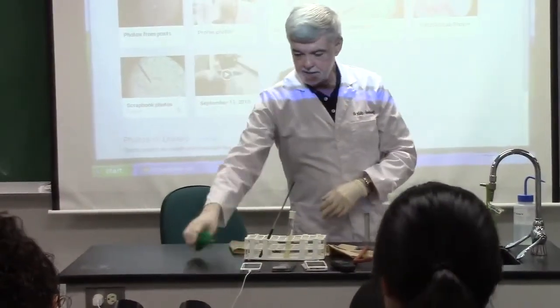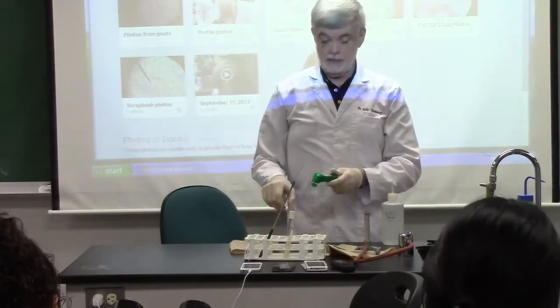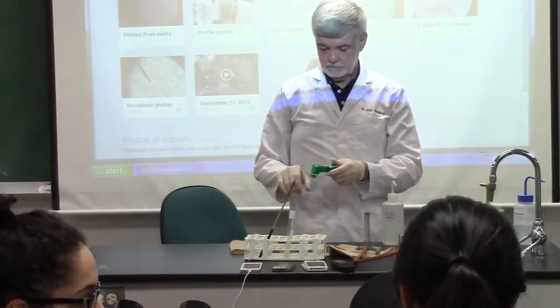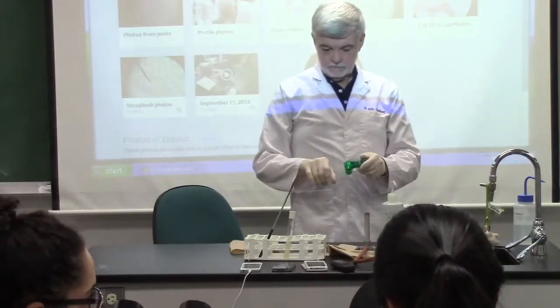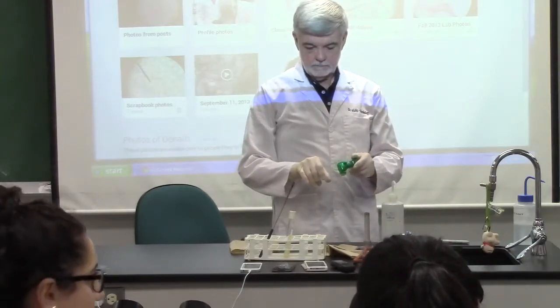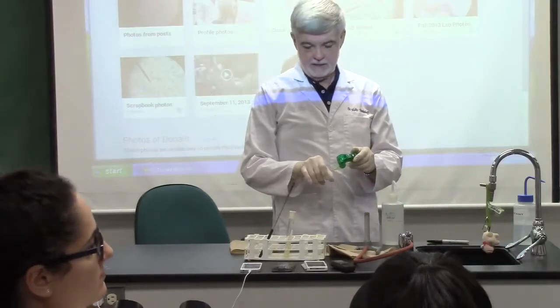Okay, so while I'm doing this, would you grab me a malachite green and a safranin? Yeah, they're probably underneath there.